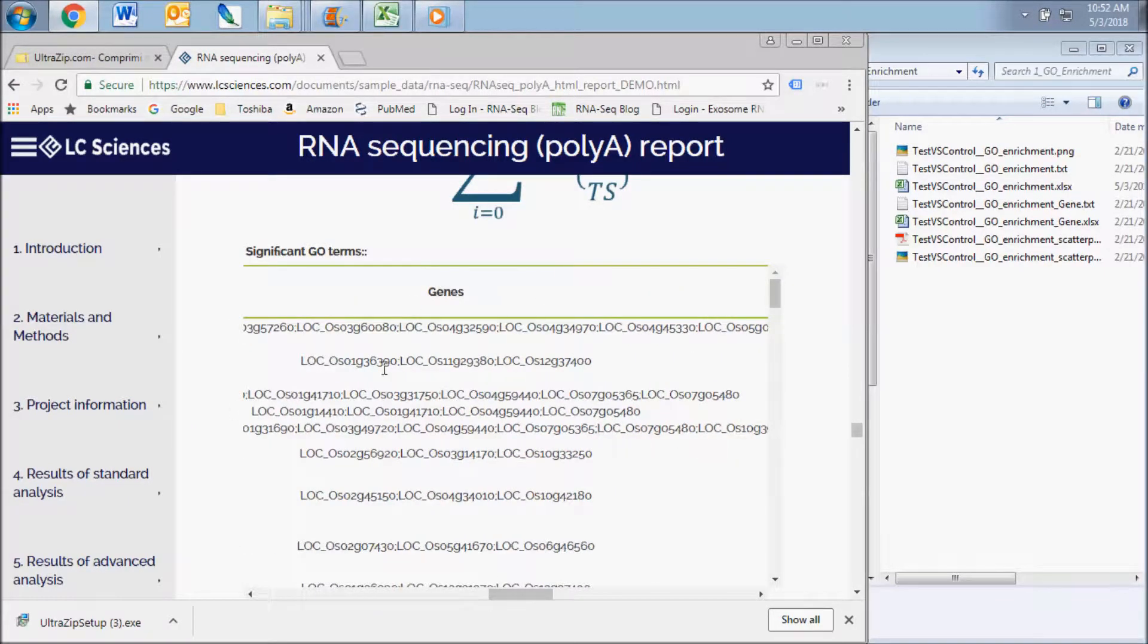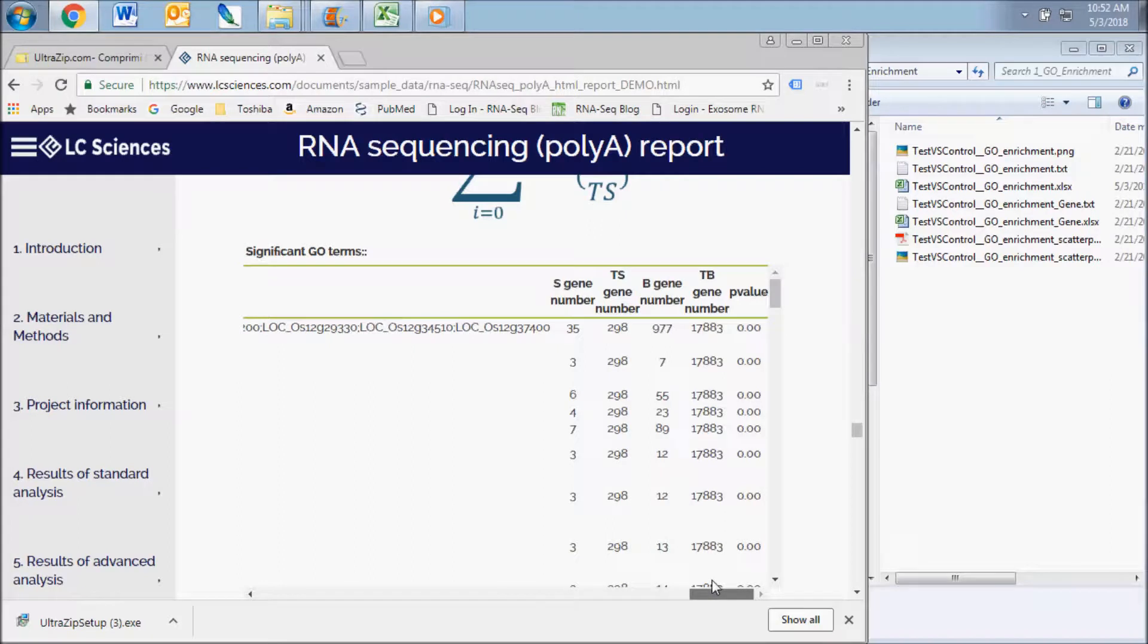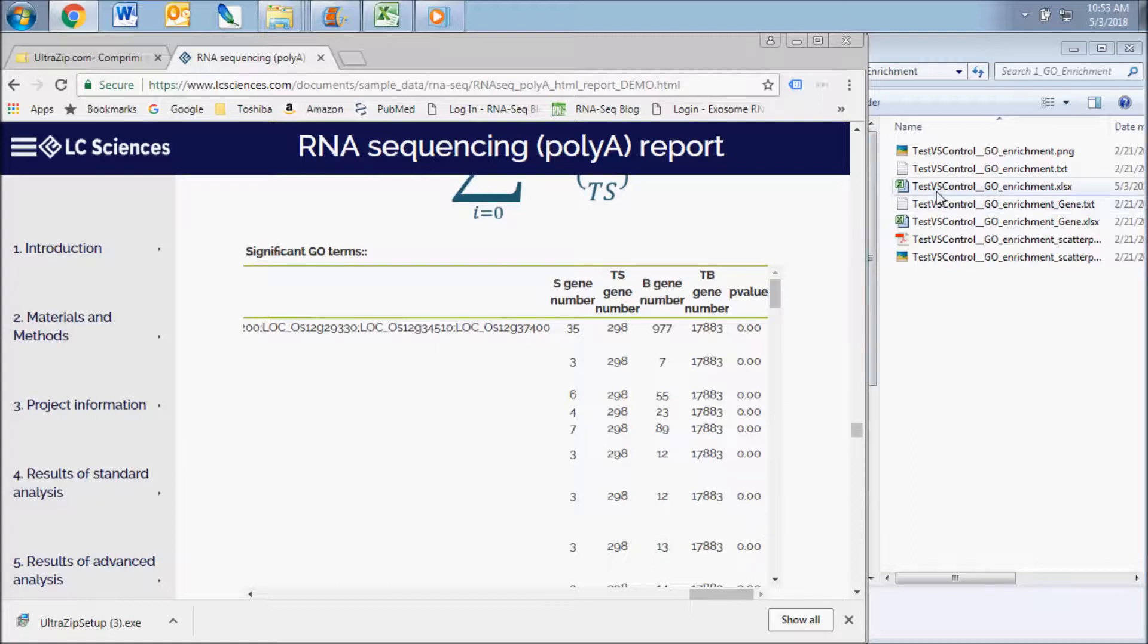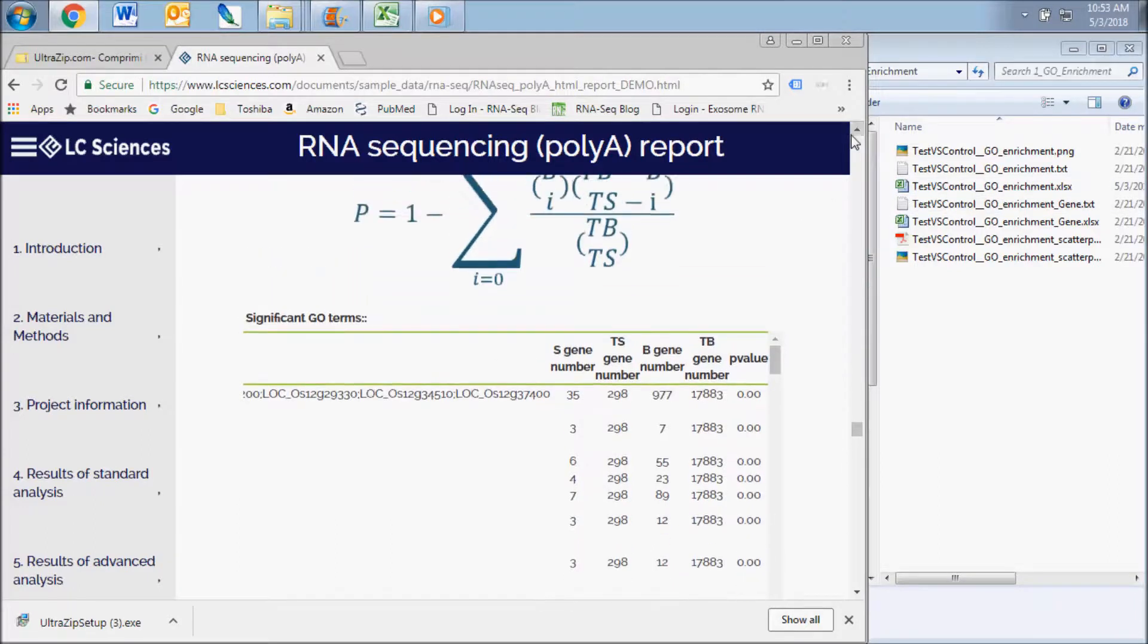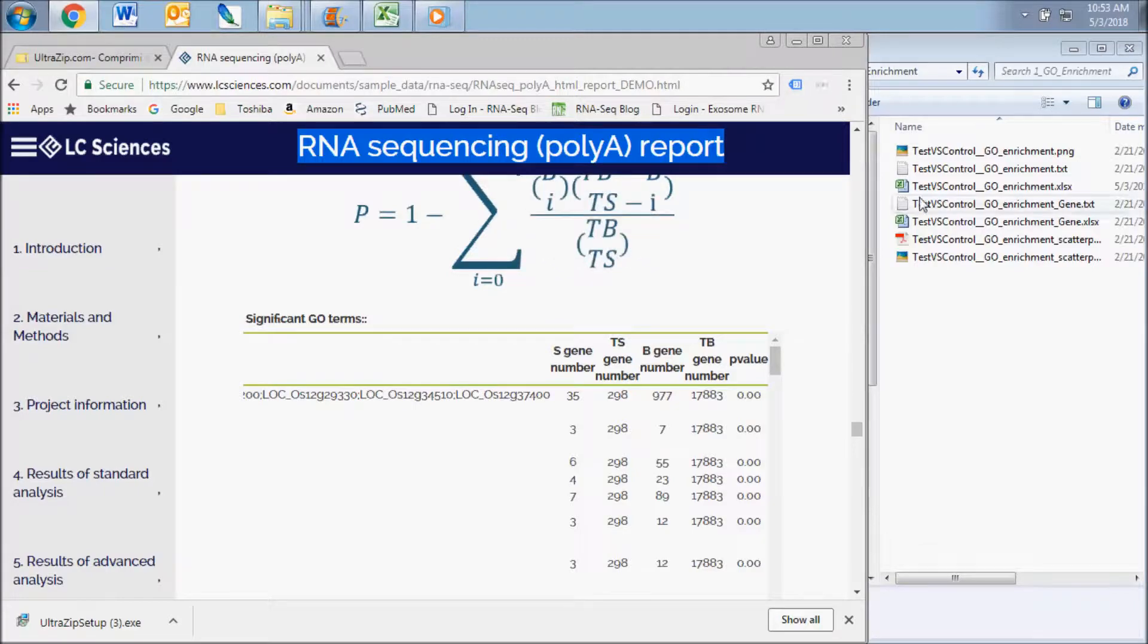The purpose of this analysis is to enable functional interpretation of the experimental expression data. A p-value is also included as a measure of significance for each term. This value is calculated by the equation as shown from the variables which are defined in the report.